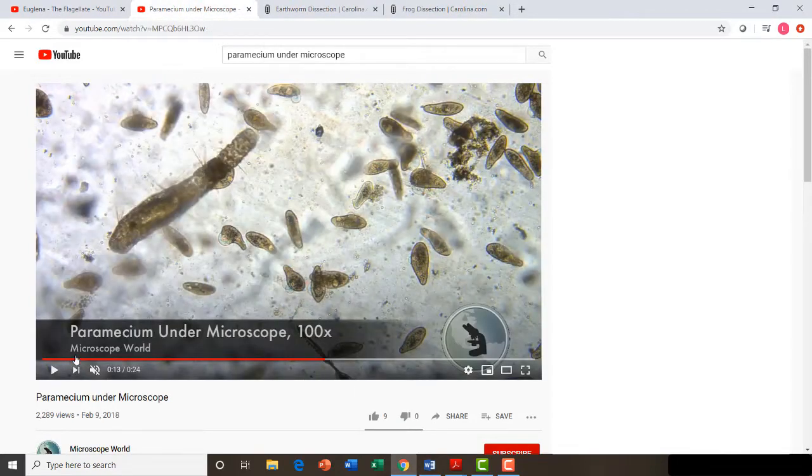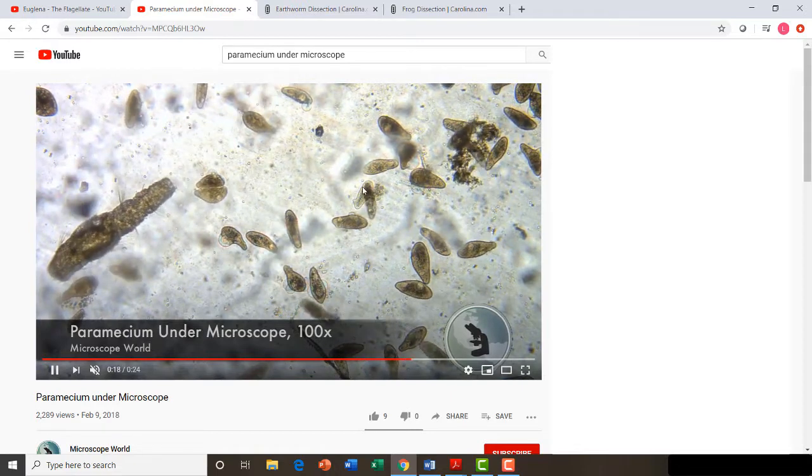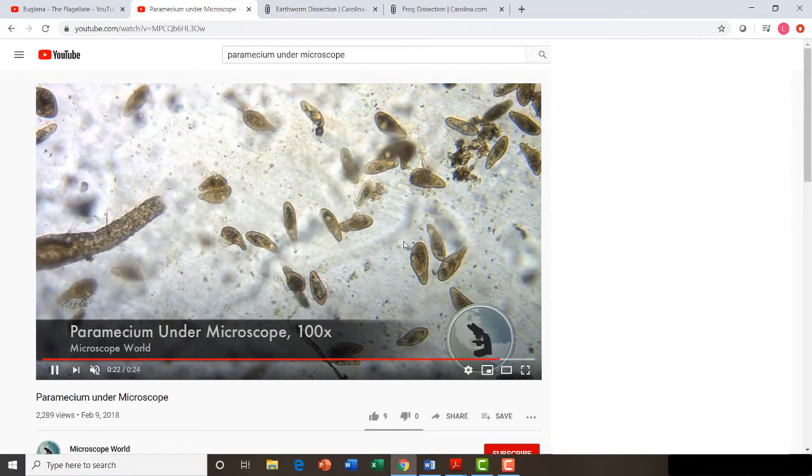So here are the Paramecium. I'm just going to play a little bit of a video. Just to let you know, I have no idea what this huge thing is. Pay attention to these smaller guys. Some of them will not be moving. They could have just gotten kind of sick and started dying while the slide was made. So I would really just pay attention to the live swimming Paramecium and how they're moving. So here you can see some of them. This guy's going to fly through.